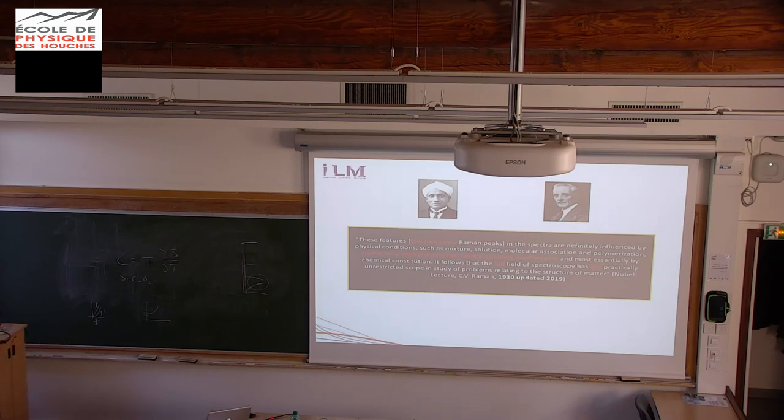I have just updated a little bit because people are never talking about low frequency, so I want to speak about low frequency. And with low frequency, you can access crystallinity, environment, mechanical coupling mechanisms, as I showed you. And this whole field of spectroscopy is still, I would say, practically unrestricted in scope. So we can still do many things with that. And with the new equipment, new lasers, and there is also stimulated Raman, there are many things to do. Thank you for your attention.